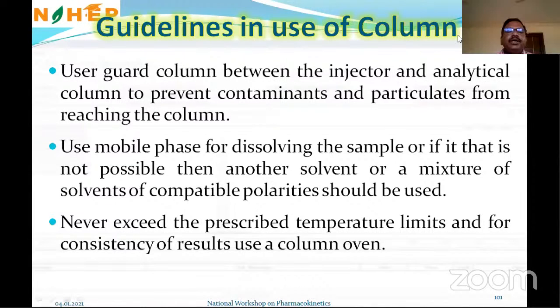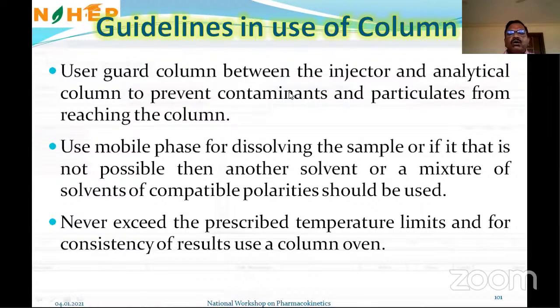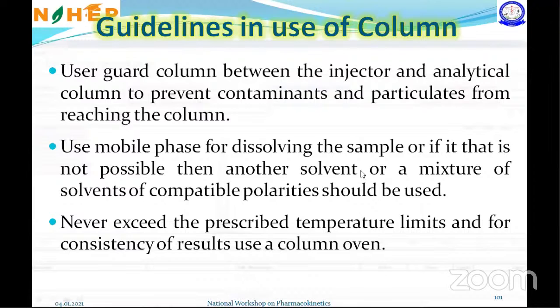So guidelines in use of column: use a guard column. The same slide as I had. Yes, you can go ahead with the same slide. Guidelines in use of a column: use a guard column between the injector and analytical column to prevent contaminants and particulates from reaching the column.